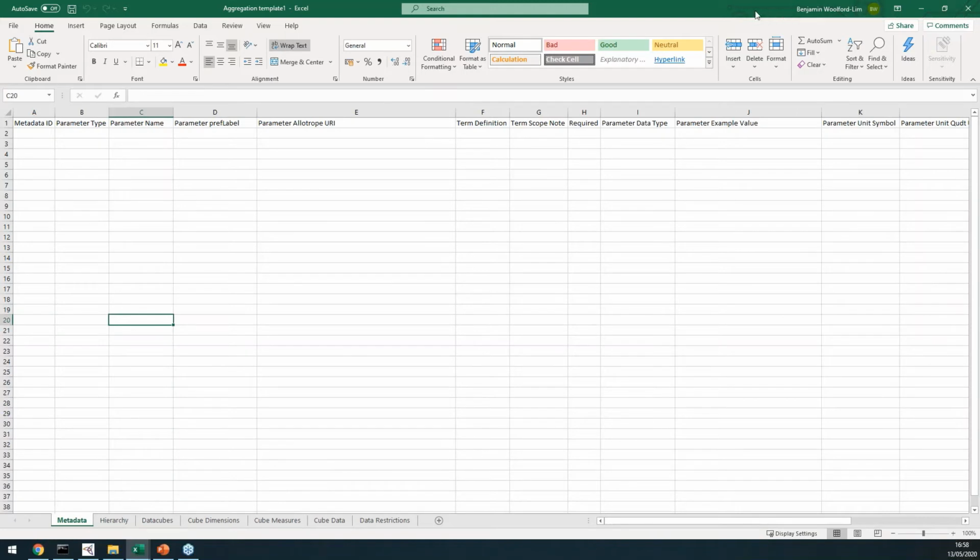So let's kick it off. Being as I'm a software engineer and not a scientist, I'm afraid I'm going to go to my usual staple of LCUV as my example, and use that to illustrate as we go through. Each of these columns has a role in what we're doing.